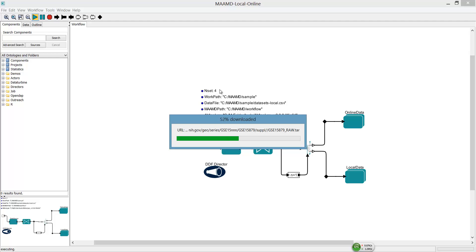Once it's finished downloading, MAMD will start to analyze the first dataset.